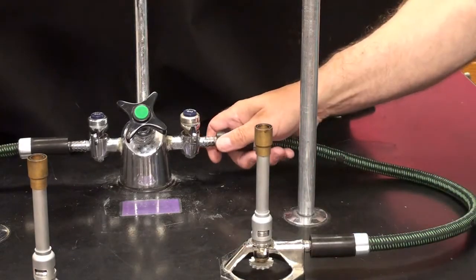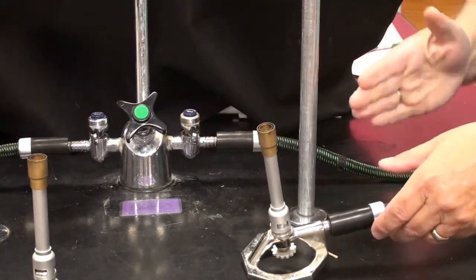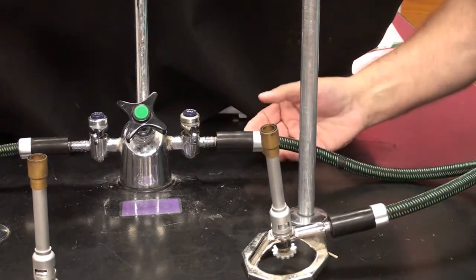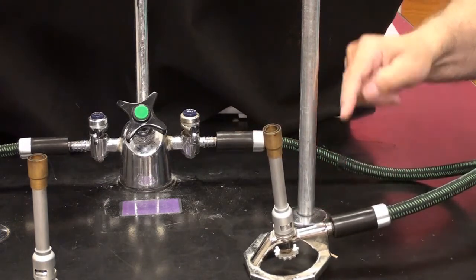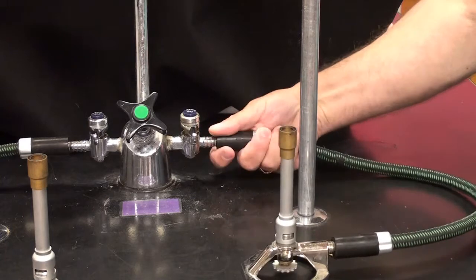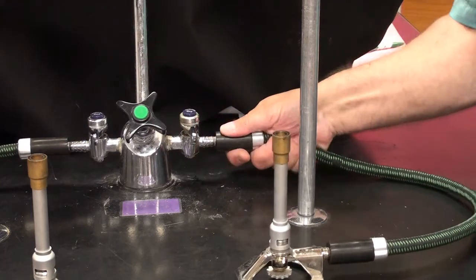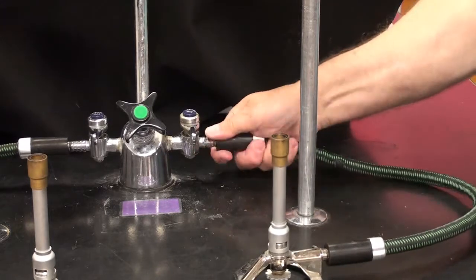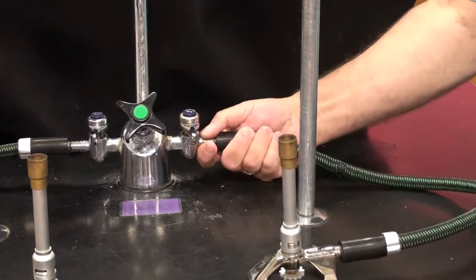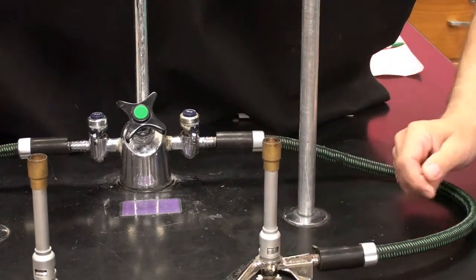Every now and then when you're going to use the Bunsen burner, you might look at it and say, oh, it looks like it's angled or not sitting right or something like that. That's usually because you need to just turn part of the hose here. It's like a garden hose. Sometimes it gets a little out of alignment and needs to just be turned a little bit. So just by turning this over here, twisting it, I can make it seat and sit pretty well.